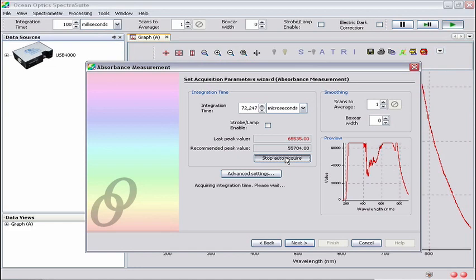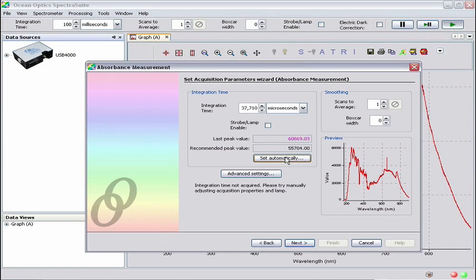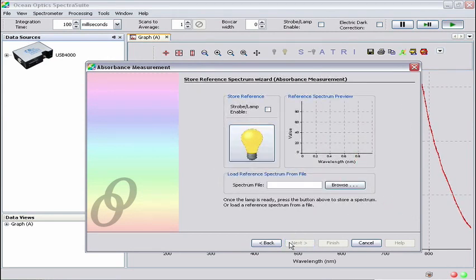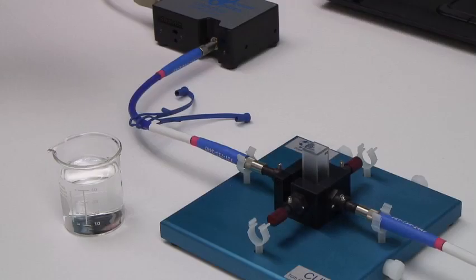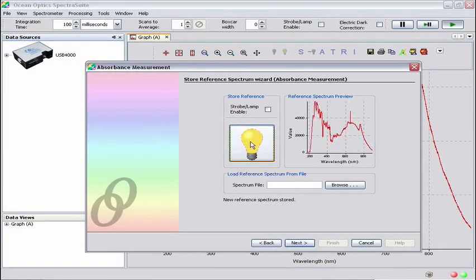Click on the Set Automatically button. This will determine the ideal integration time for this experiment. Now that integration time is set, let's add some scans to average. We're using 10 scans to average to improve the signal-to-noise ratio. To smooth the signal, use a boxcar width of 2. Now click Next. We are now in the Store Reference Spectrum Wizard window. Since we are manually controlling the light source with the toggle switch, we do not need to click the Strobe Lamp Enable checkbox. Make sure that your reference — the empty cuvette — is in the cuvette holder and the light source shutter is open. Click on the yellow lightbulb button to store the reference. Once the reference is stored, a preview of the spectrum is shown in the Reference Spectrum preview pane.